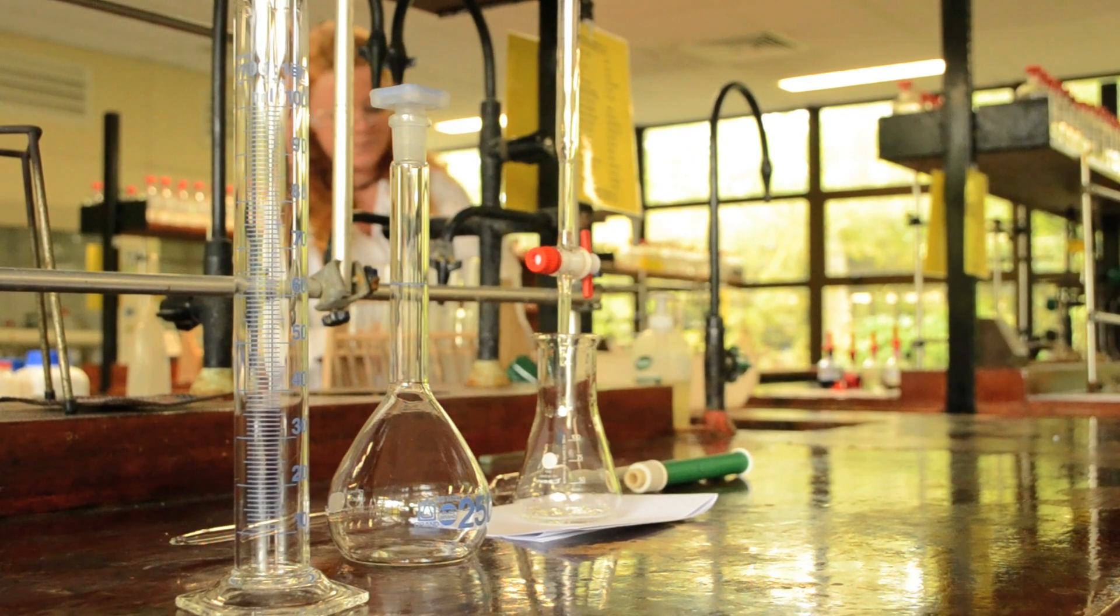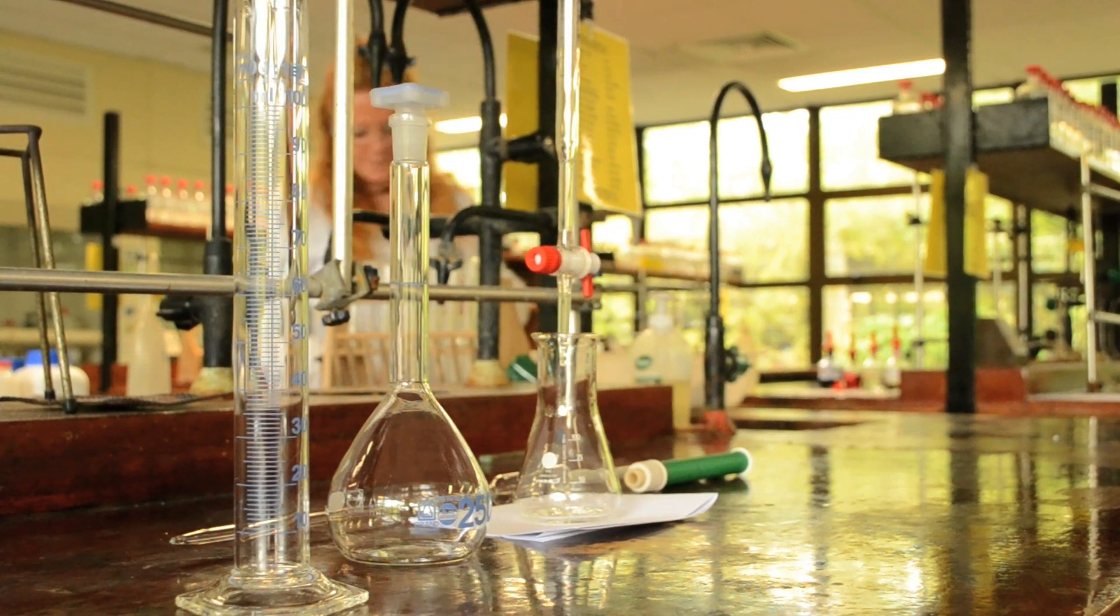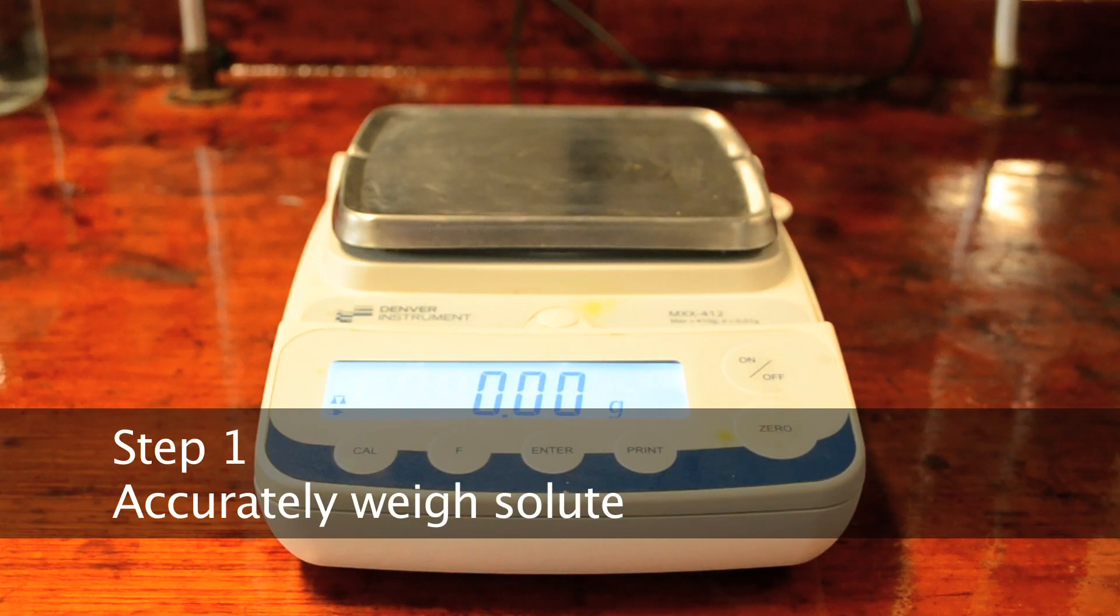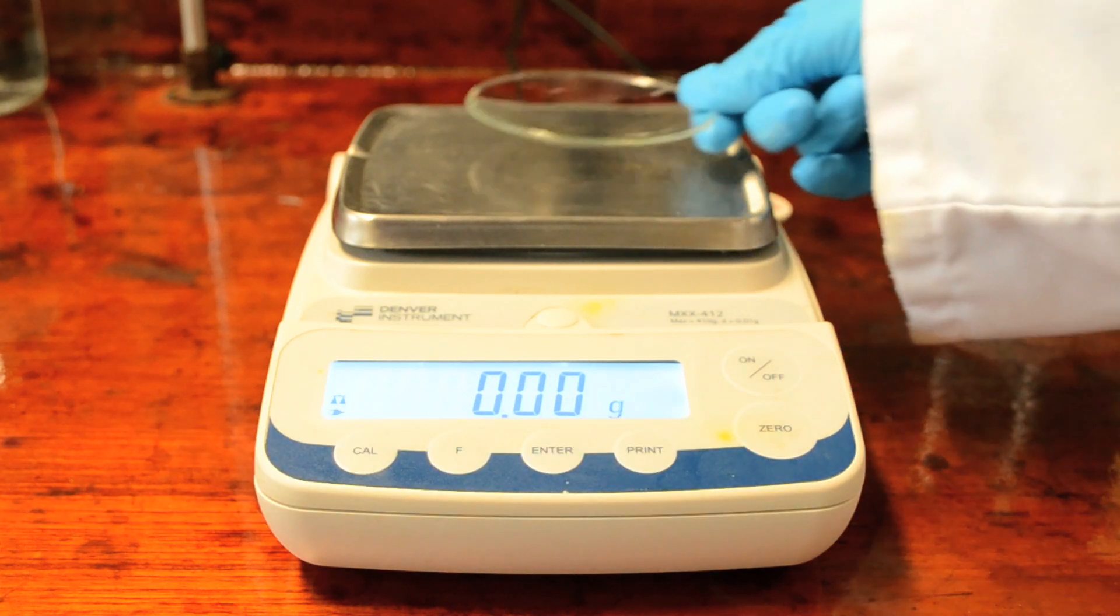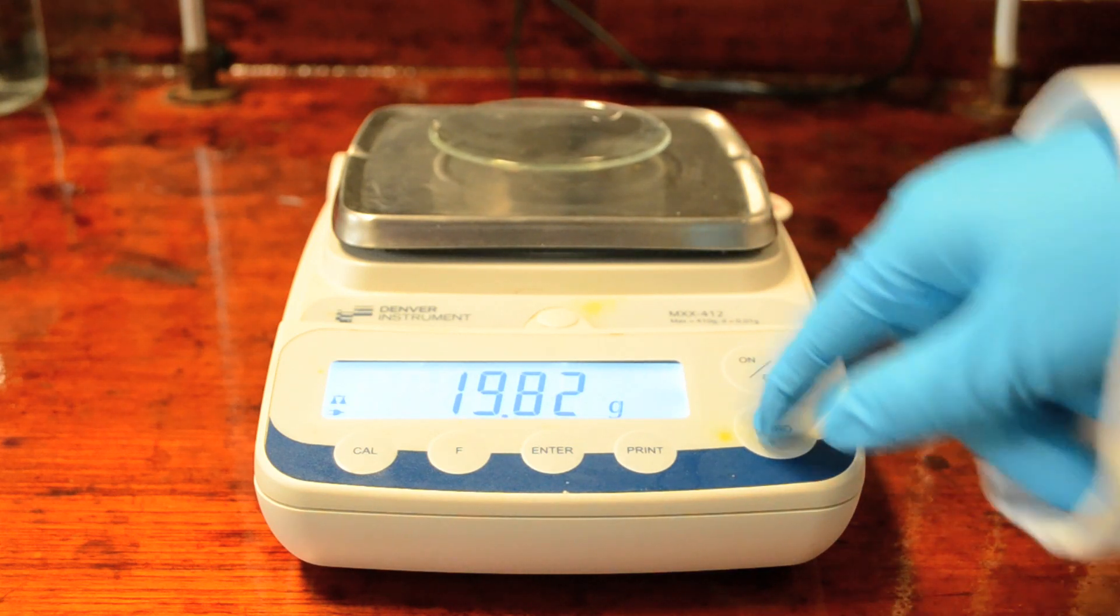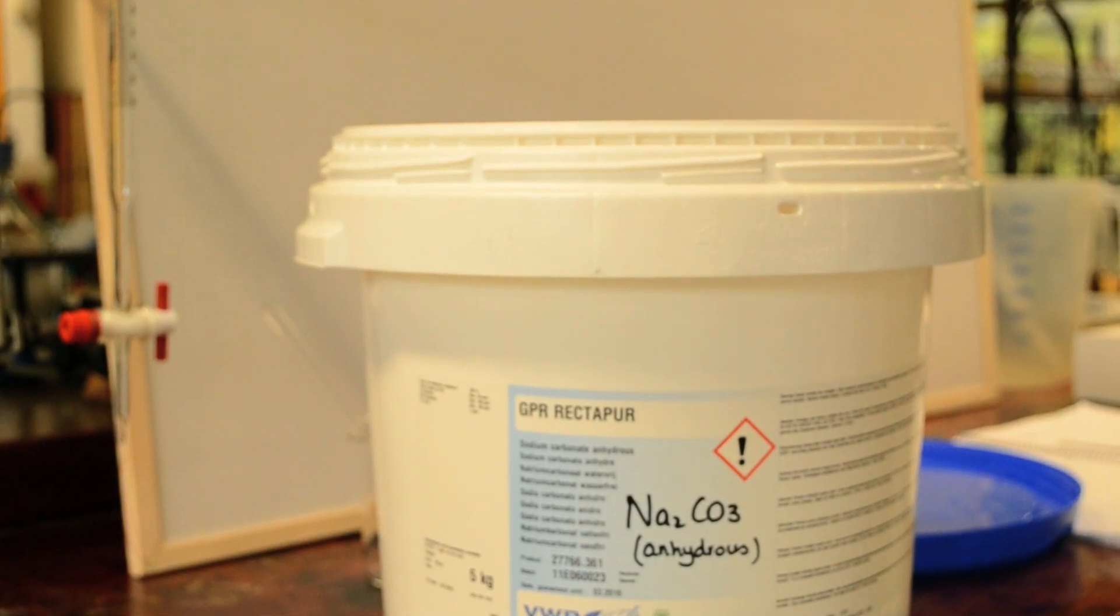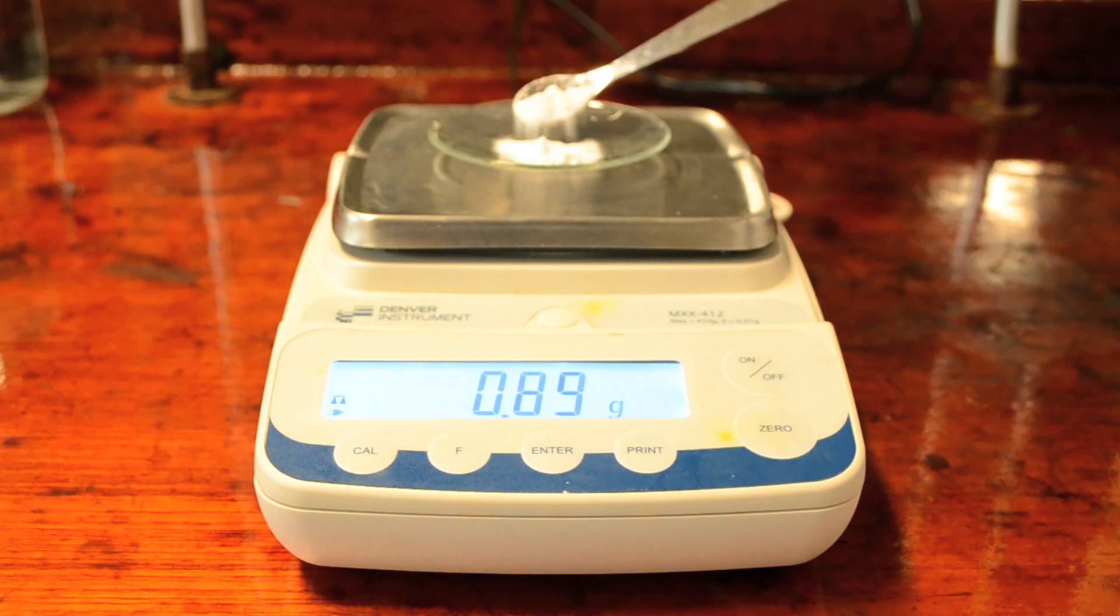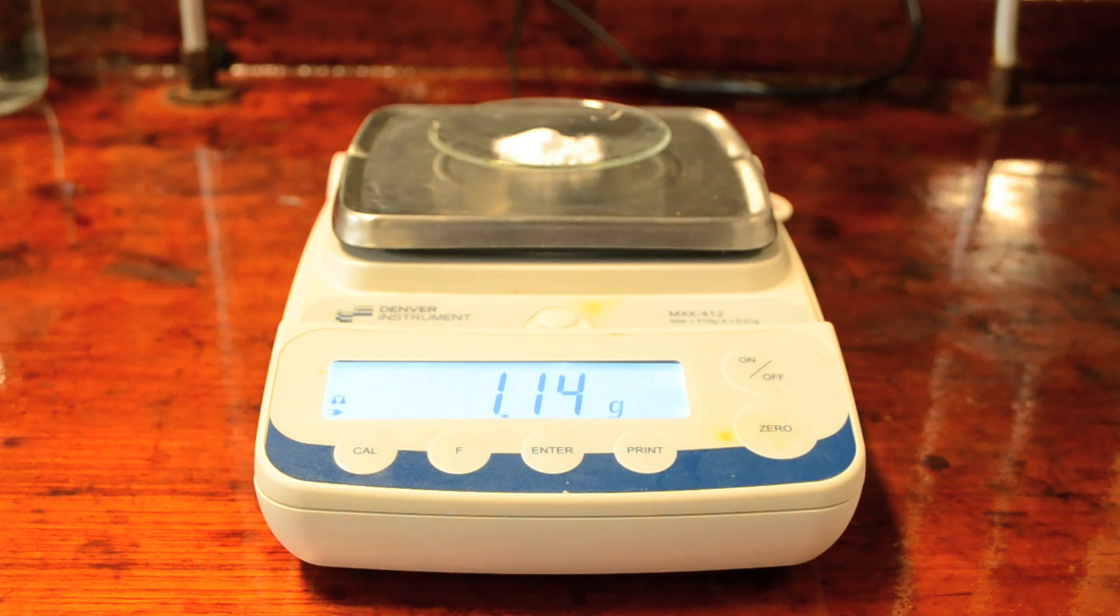I'm going to take you through the steps to accurately weigh out our solute that we're going to use to make up a standard solution. To do this, we're going to use a laboratory balance. I then place a clock glass on top of the balance and re-zero. I'm aiming to weigh out 1.3 grams of anhydrous sodium carbonate. It doesn't have to be exactly 1.3 grams as long as I know exactly how much I've weighed.